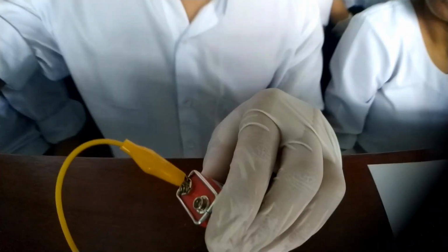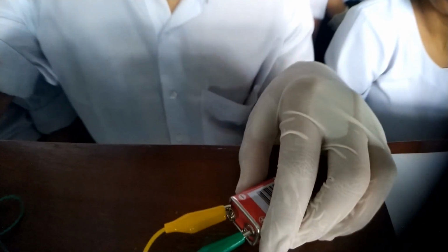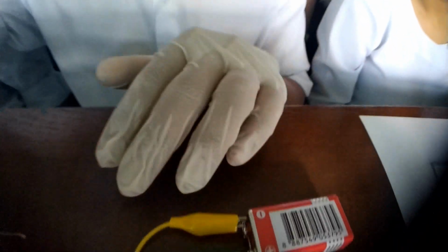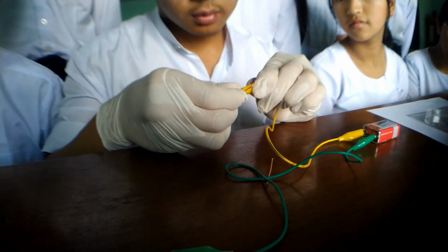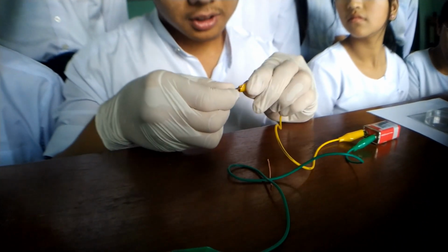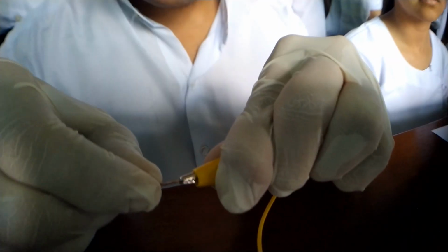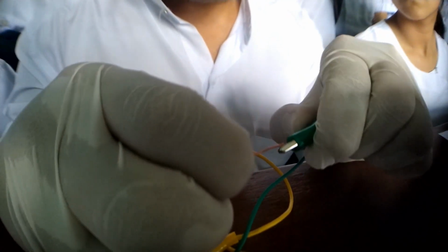This microdrop pipette is one of the apparatus contained in the small-scale lab kit and is very easy and convenient to use. In this solution, copper(II) sulfate is ionized. It breaks apart into Cu2+ ions and SO4 2- ions. Since it is an aqueous solution, it contains water, and the water is also ionized as H+ ions and OH- ions.